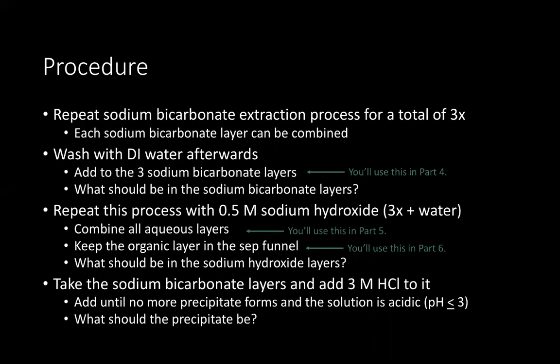You're going to repeat the sodium bicarbonate extraction process for a total of three times, so you should do it two more times after the first one. Each sodium bicarbonate layer can be combined together, so you don't need to create lots of separate beakers. After your three sodium bicarbonate washes, you'll wash a final time with deionized water. That wash can also be added to the three sodium bicarbonate layers. Label that solution carefully — you'll use it in part four.